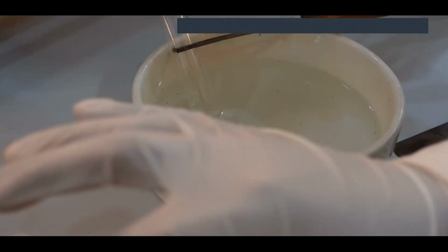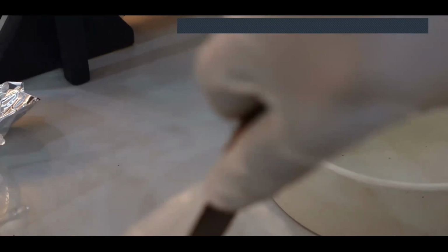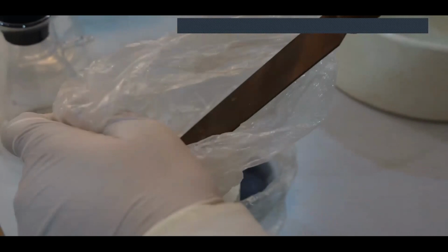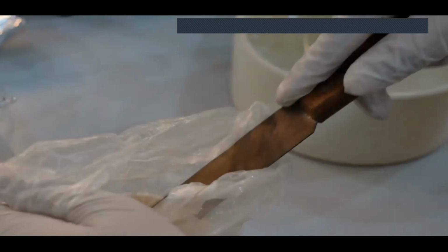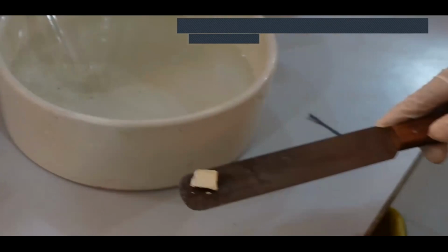Now, a couple of things that you should notice. First of all, as you can see, I'm wearing gloves and I'm not touching this metal right away. Sorry, the quality is just okay. And so I'm taking this metal out of this container. By the way, in this container, I have oil. And this is sodium, a piece of sodium that I've taken out.